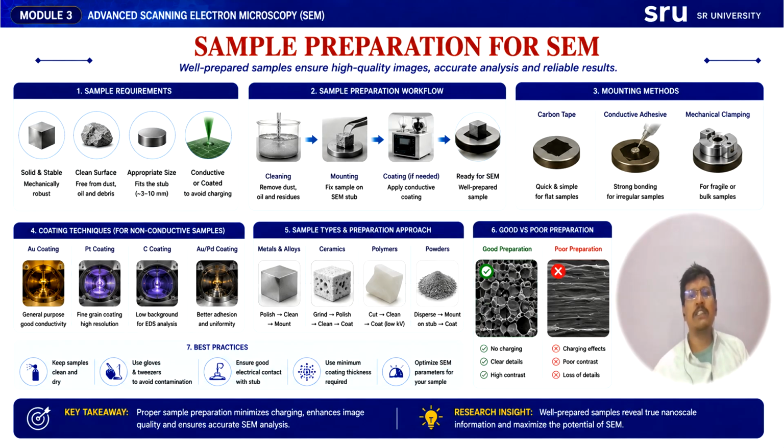In nanomaterials research, proper sample preparation is crucial because nanoscale features can easily be obscured by contaminants or charging effects. Thus, sample preparation serves as the foundation for obtaining reliable SEM images and meaningful analytical results.